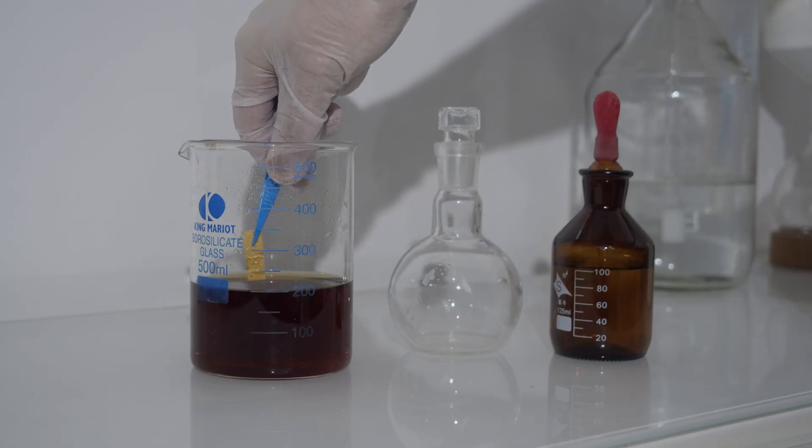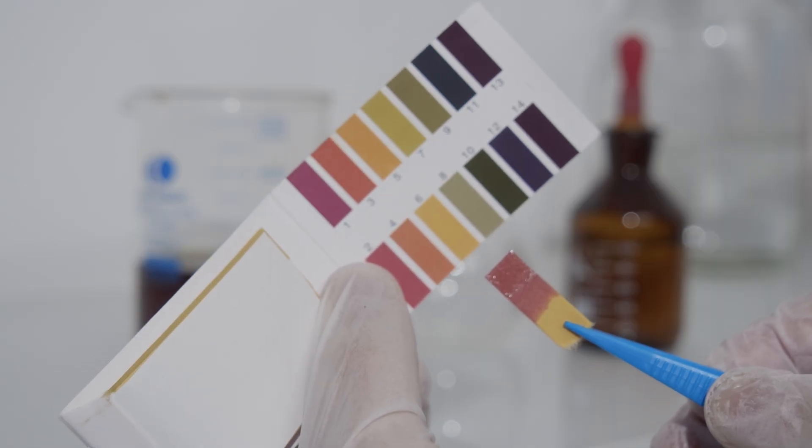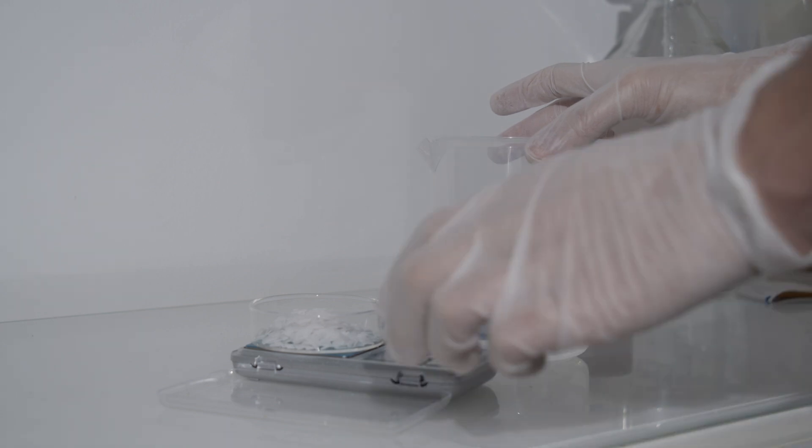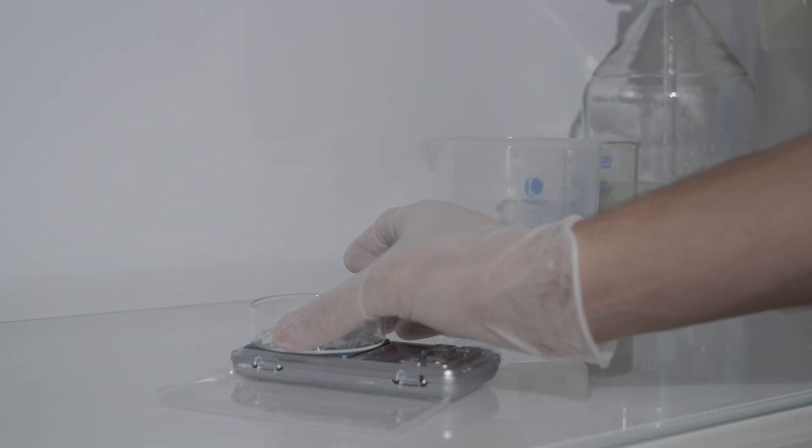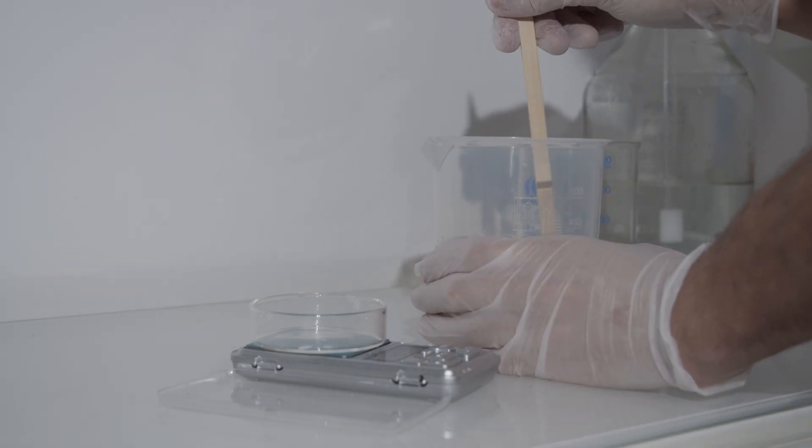After oxidation, we test the pH of the iron 3 sulfate solution and it was highly acidic. To neutralize it and precipitate the iron hydroxide, we prepare a solution of potassium hydroxide in water by dissolving around 10 grams of potassium hydroxide into 100 milliliters of distilled water.